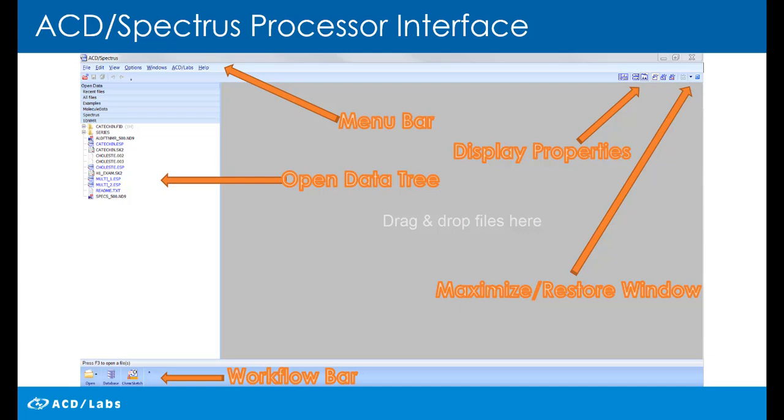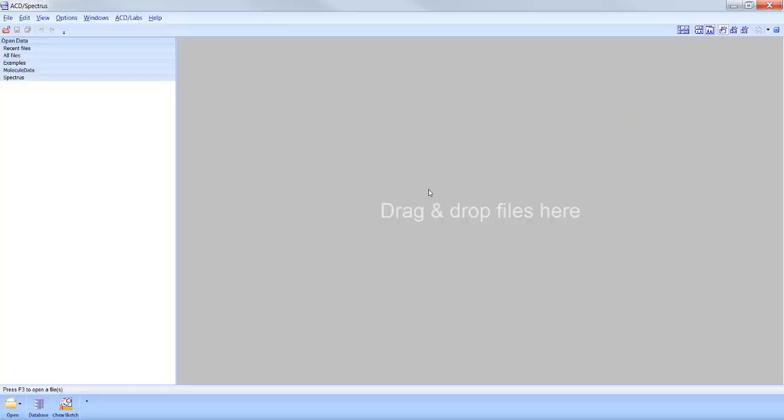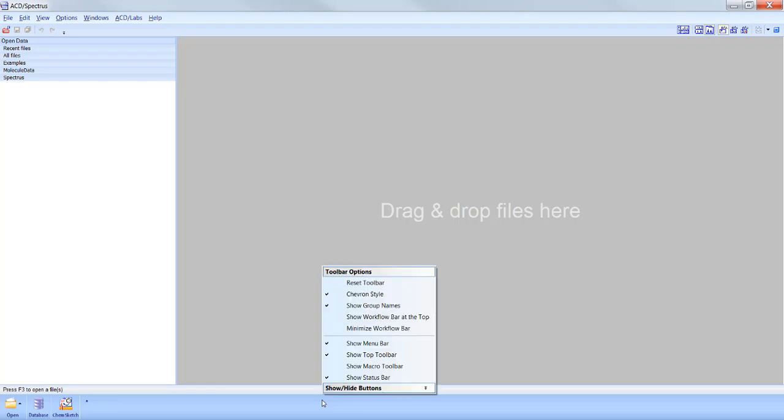ACD Spectrus Processor Interface. Right-click to move the workflow bar to the top or to minimize.